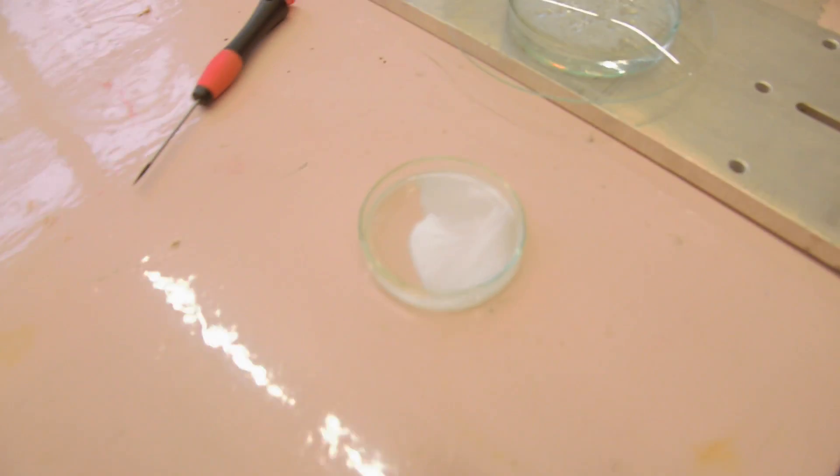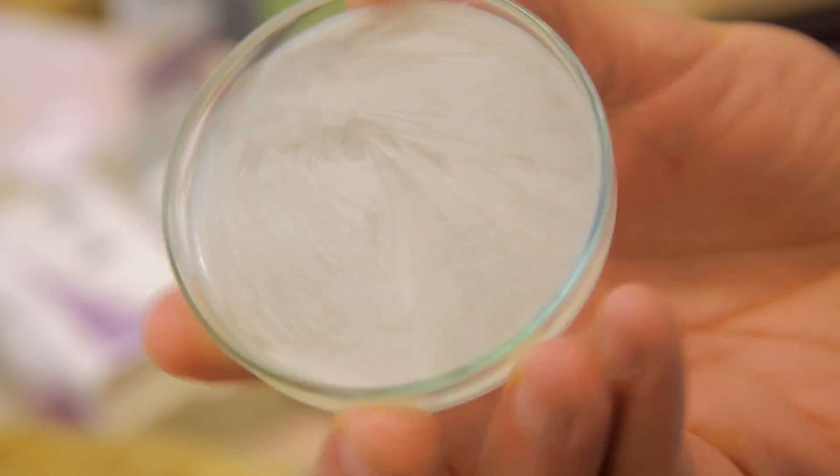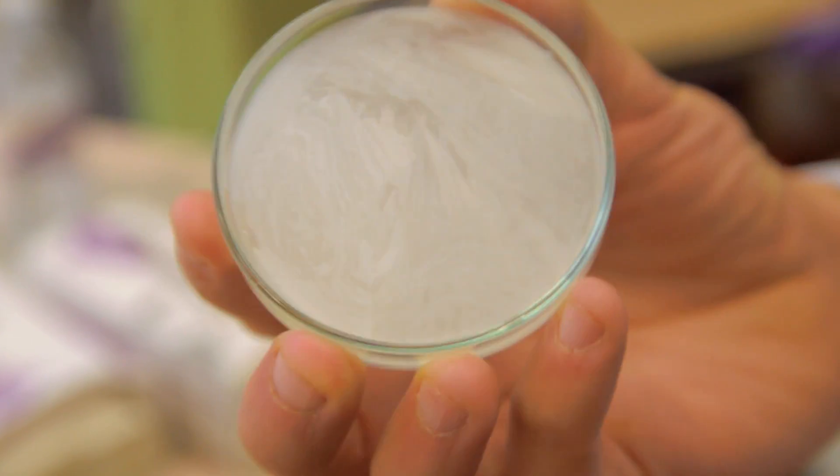It's gone wrong already. This is sodium acetate which was a liquid until about 10 seconds ago and has suddenly turned into a solid, which wasn't supposed to happen just yet.